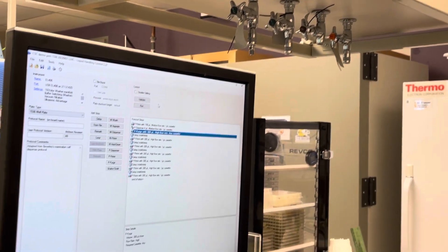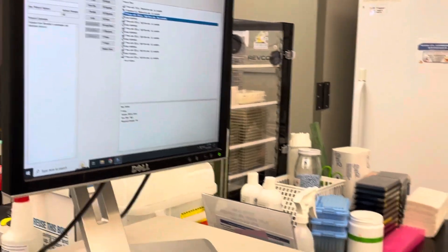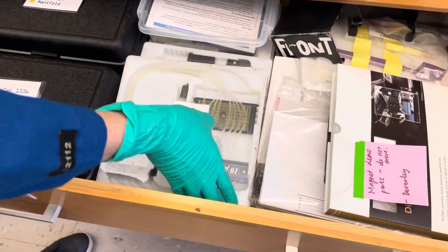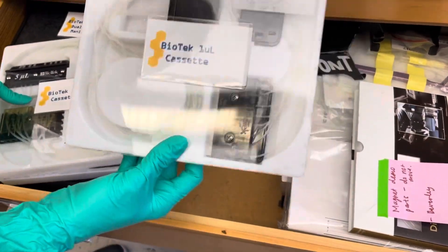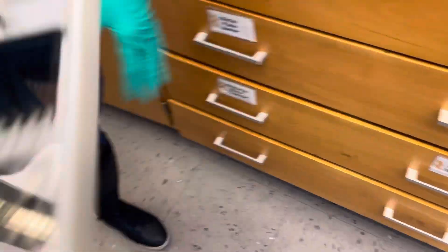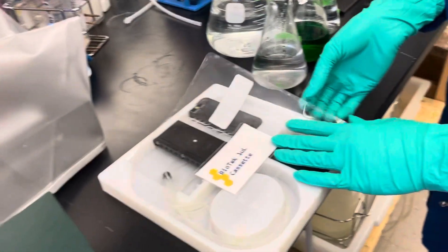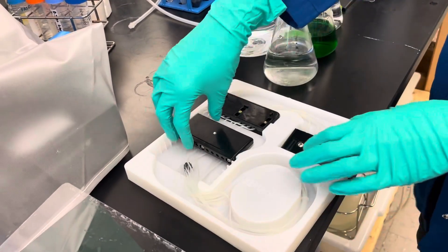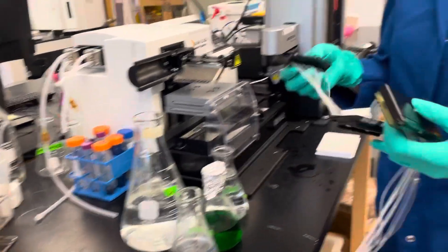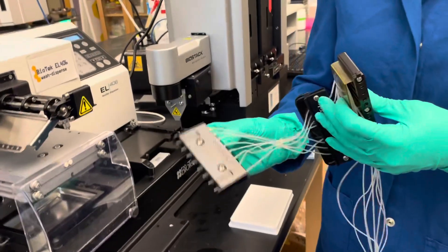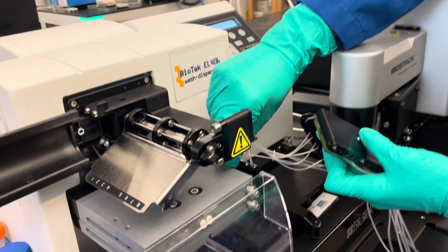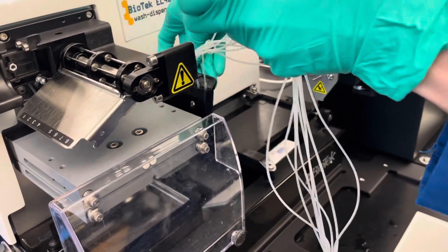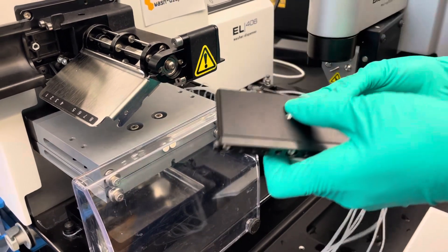Once your protocol is ready, you need to load the cassette. We're going to be using the one microliter cassette. The cassettes are in the second drawer. The different ones have different tube diameters — the one microliter cassette has the skinniest tubes. Peel off the top and gently remove the cassette. You start with this piece and have to hold it in your right hand because it has to be pointing that way. If you do it the wrong way it kind of sort of fits, but if you do it the correct way it actually clicks into place.